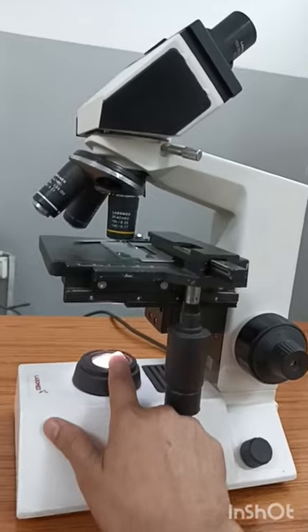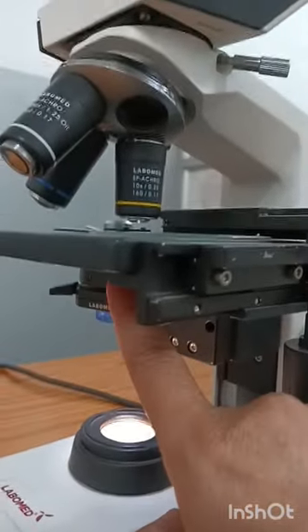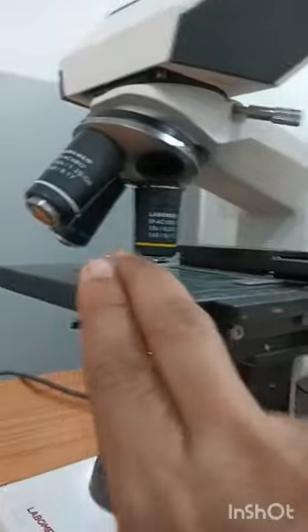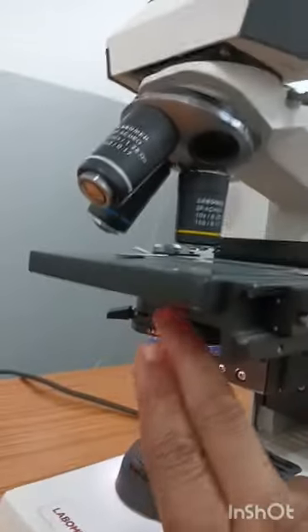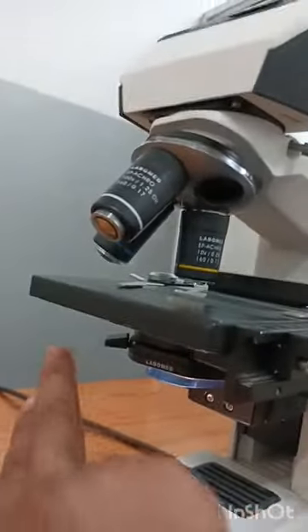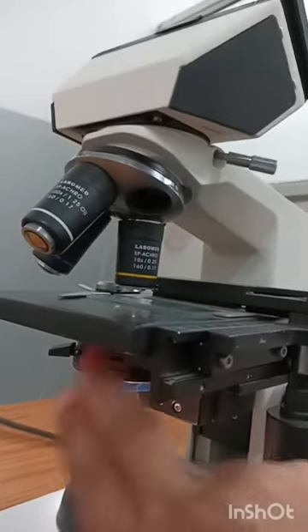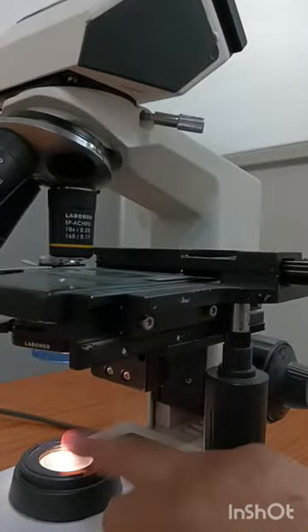The lamp is fitted within it. The other part is the condenser, which is also called the sub-stage condenser. This condenser condenses the light source which is coming from the light source.